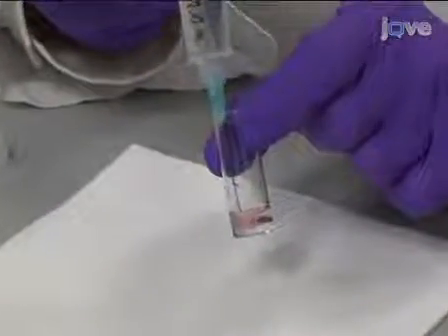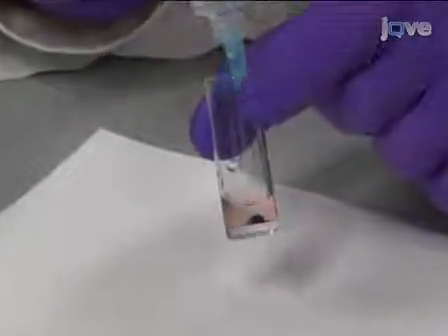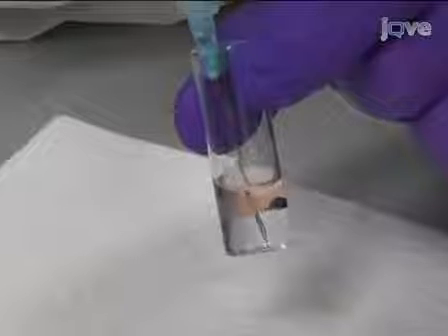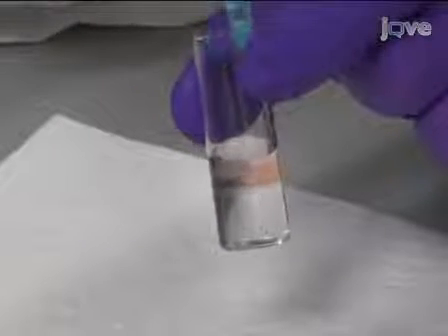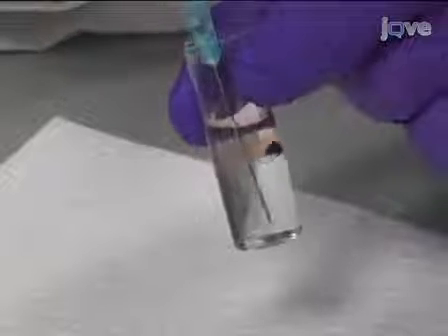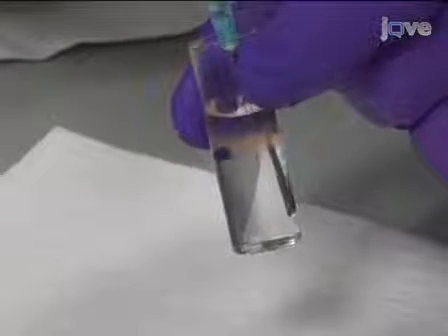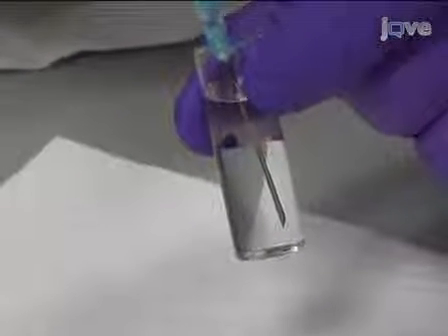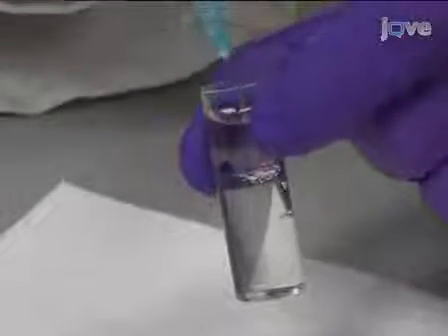Start by inserting the needle along the side of the tube at the periphery of the solidified histogel disk. Continue by rotating the needle along the side of the tube while at the same time slowly pushing the formalin solution through the syringe. Observe the separation of the histogel button from the flat bottom of the glass tube.